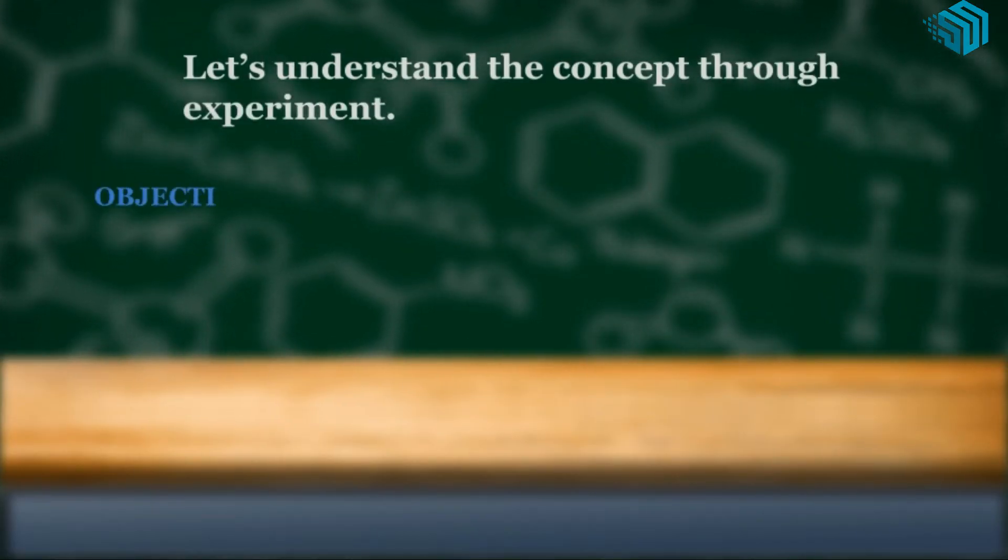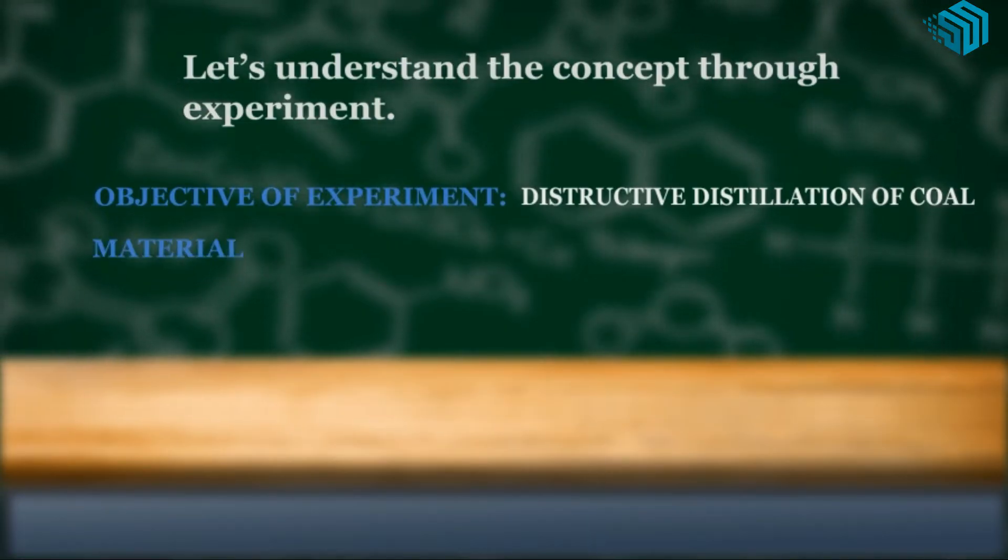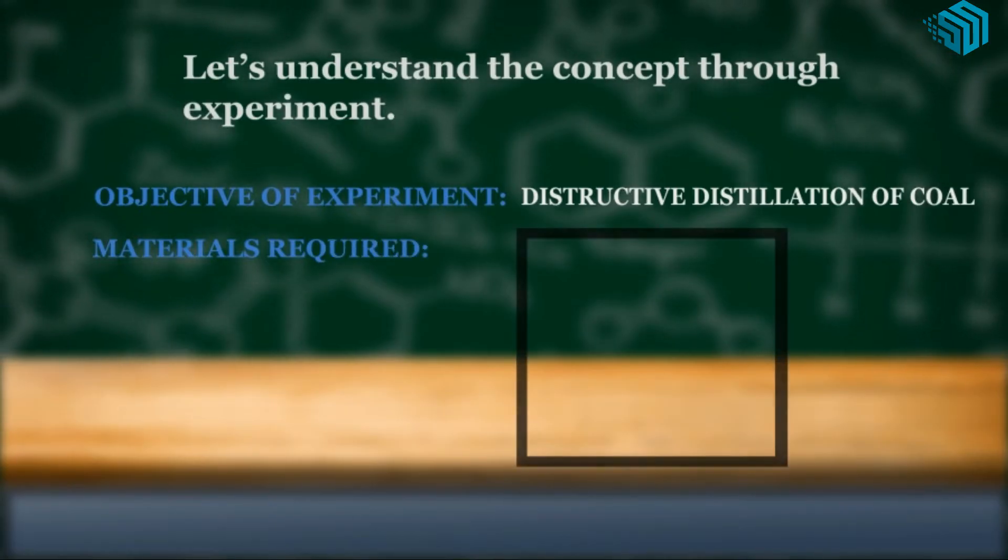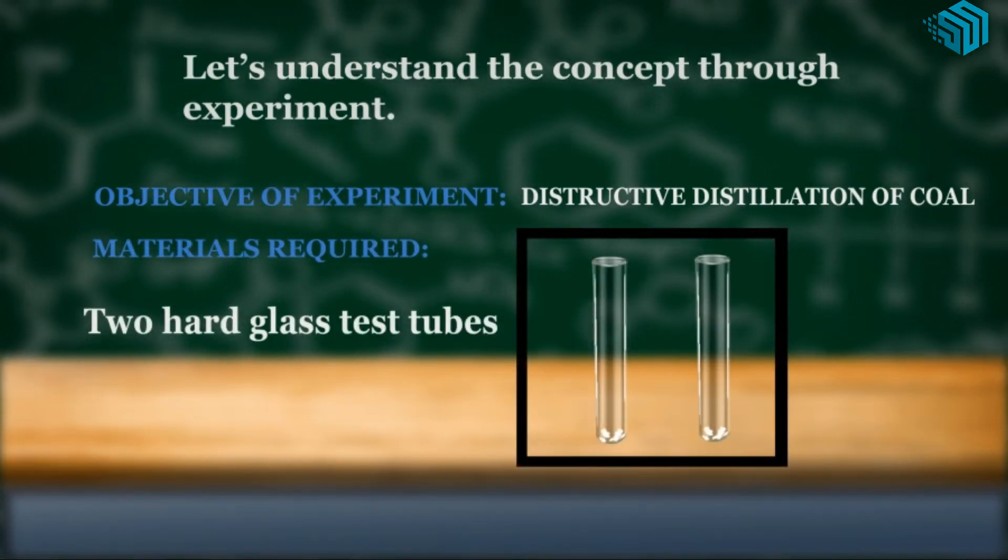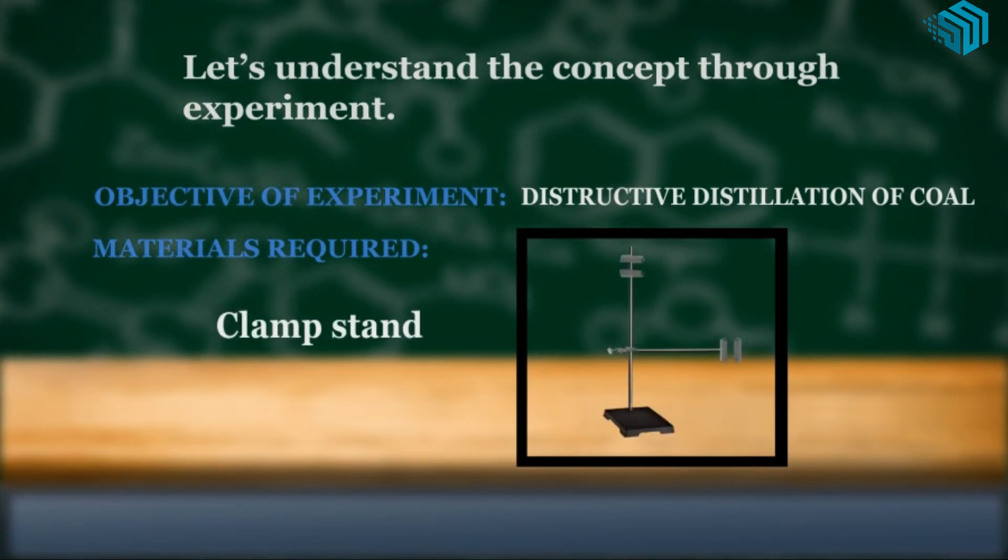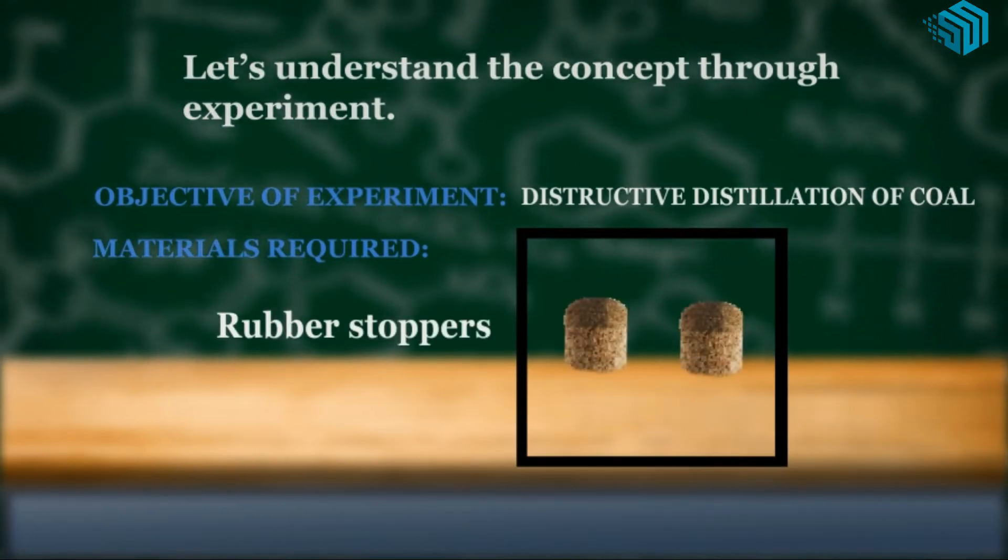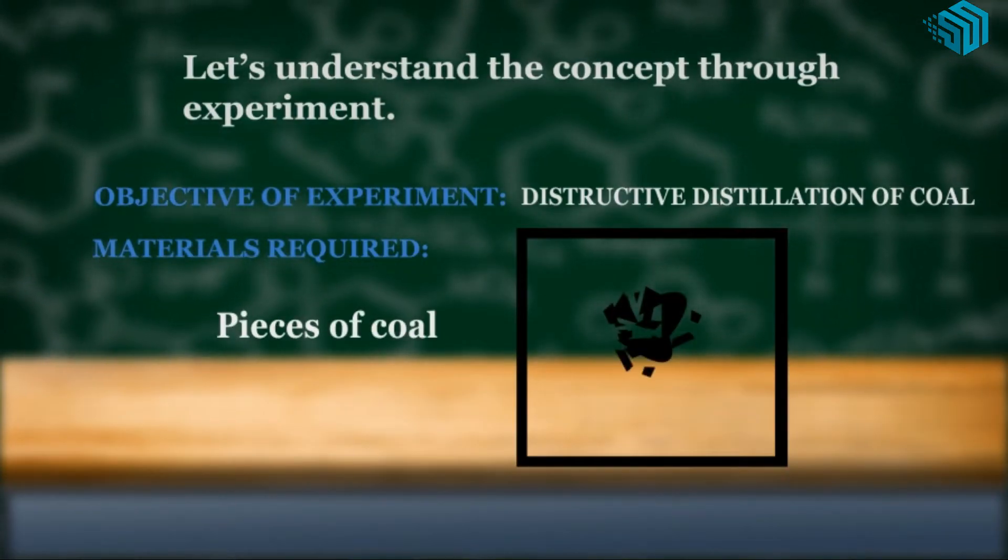Objective of the experiment is destructive distillation of coal. The materials required are two hard glass test tubes marked A and B, delivery tubes, clamp stand, burner, rubber stopper, pieces of coal and water.